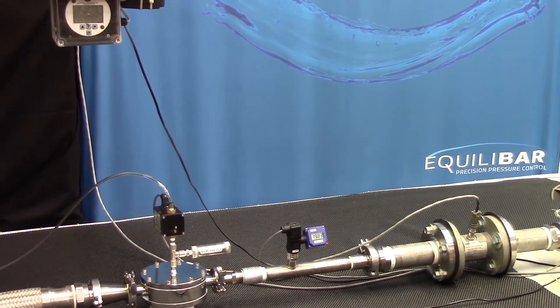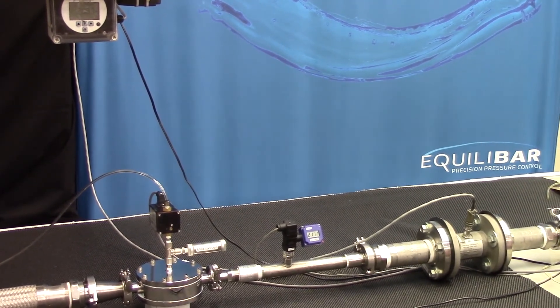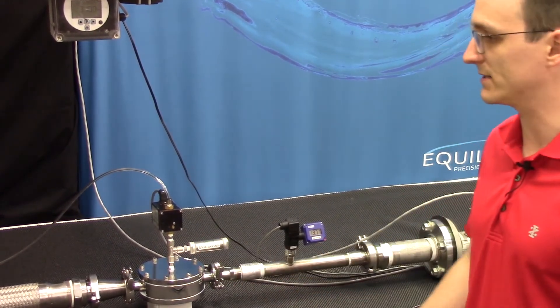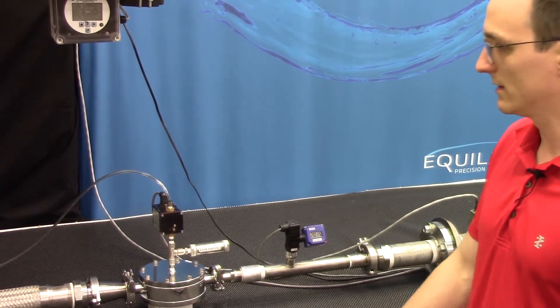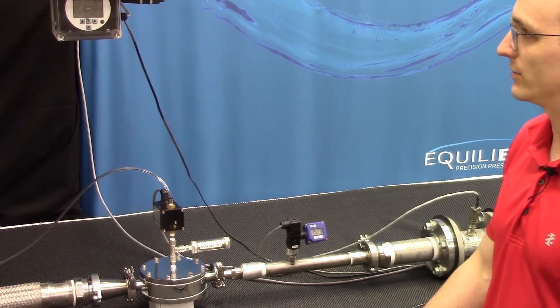All right, so this represents a saturation condition where we've approached the valve's maximum capacity, which has a CV of 8, and we see that the inlet pressure is still stable at our 20 psi set point.